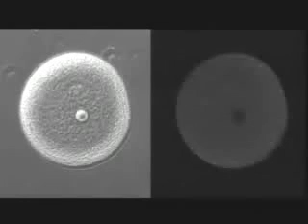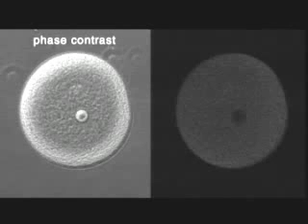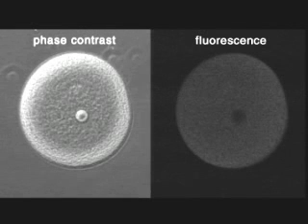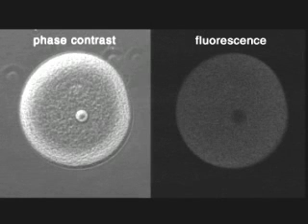A sea urchin egg during fertilization is visualized here simultaneously by phase contrast microscopy and by fluorescence microscopy. The egg contains a fluorescent dye that becomes brighter in the presence of calcium ions.